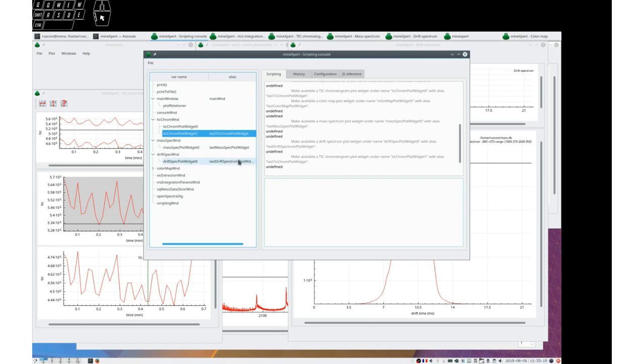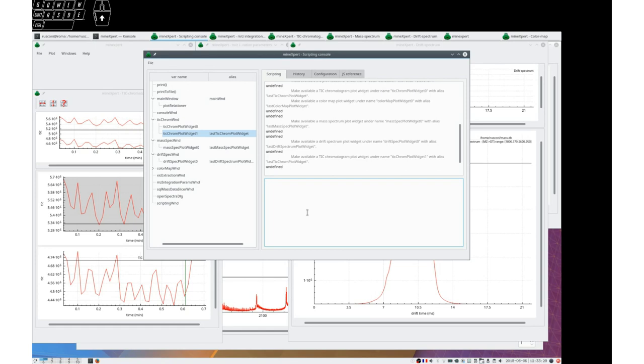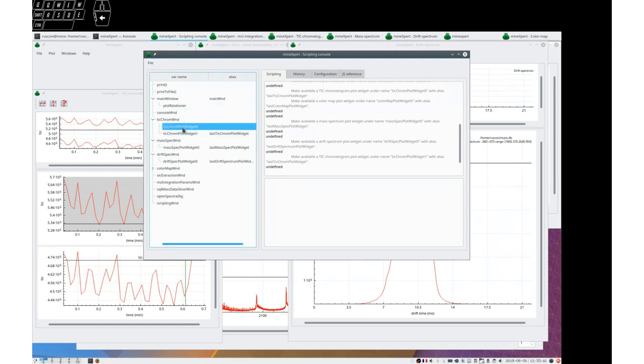This is good. You now know that you have these Javascript integrate to mz, rt, dt functions. But how do you inspect what these different elements are able to do? That's easy. For example, let's look at tick Chrome plot widget zero. Press control and double click it.